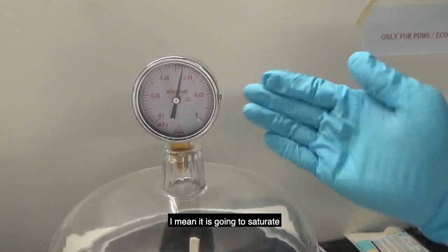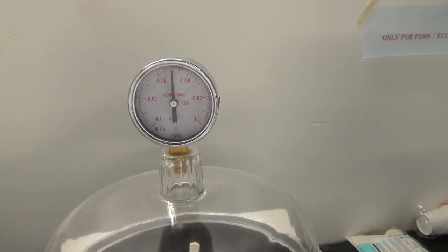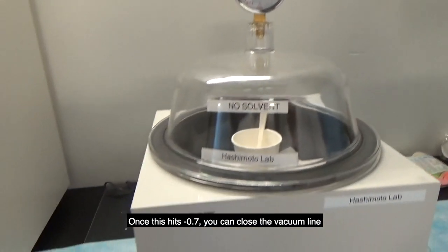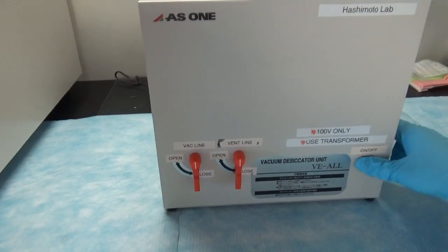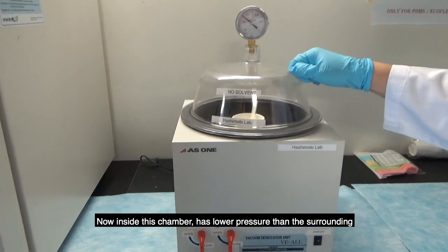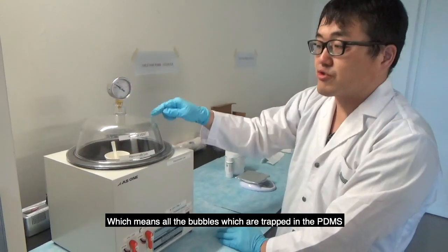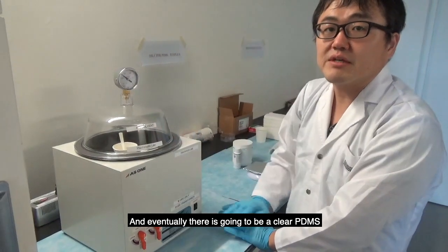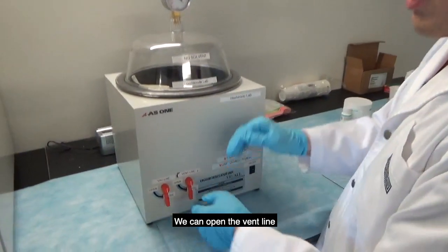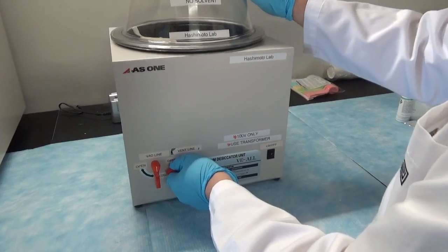Eventually the gauge will stop and saturate. Once it stops, you can close the vacuum line. Once the reading hits minus 0.07 or so, you can close the vacuum line and also close off the chamber. The inside of the chamber now has lower pressure than the surroundings, and this is going to degas the PDMS — all the trapped bubbles will rise and eventually you'll have clear PDMS. Wait here for some time. After most of the bubbles are gone, open the vent line.